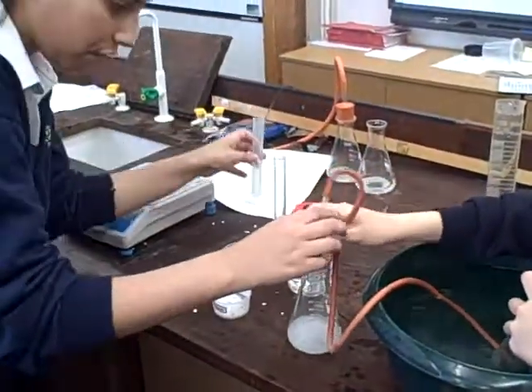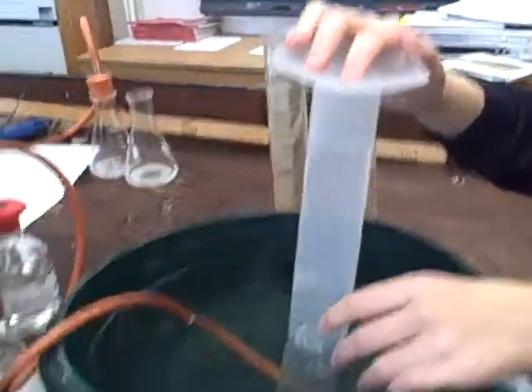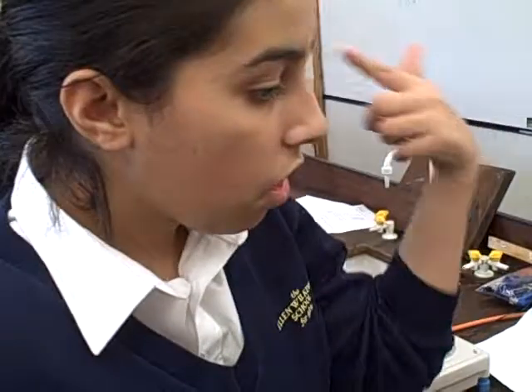Now our reaction is quite fast, so we have to do this quickly. And as you can see, the gas is going into the collection vessel. With this reaction, carbon dioxide is lost, and we can measure the rate of reaction using the fact that we can see the products being made and the reactants being used up.